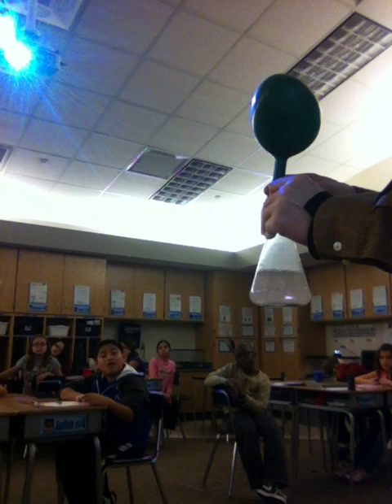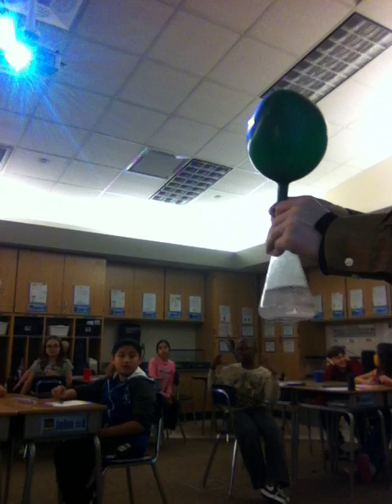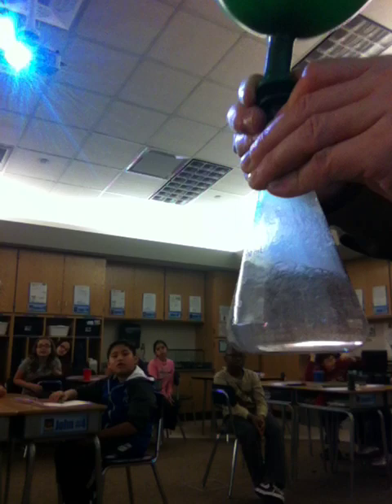Better than a helium balloon, right? Hydrogen has one proton, helium has two — so hydrogen is twice as light. You can see the balloon is starting to inflate. The only gas inside this balloon right now is hydrogen gas — just hydrogen, nothing else. I'm not inflating this balloon, just the gas from inside the flask.